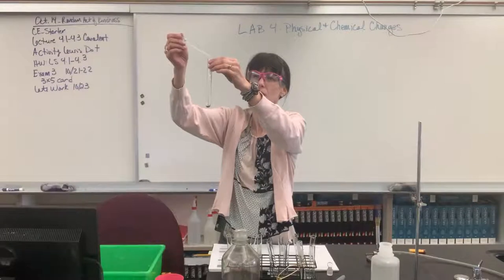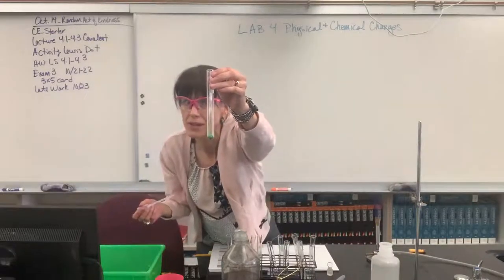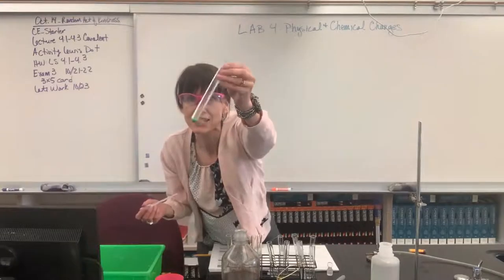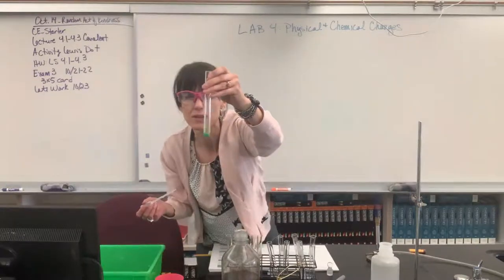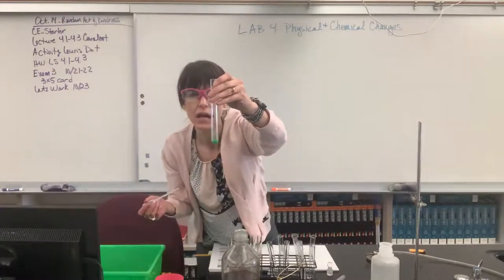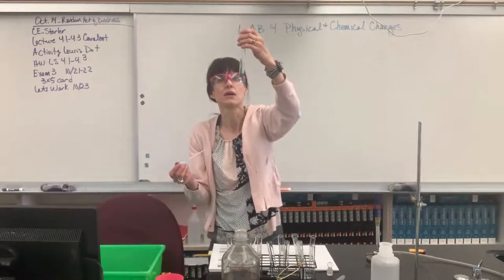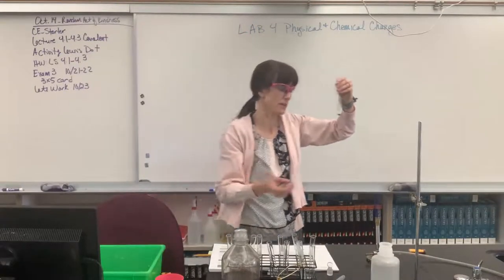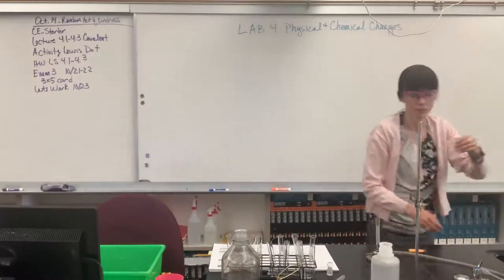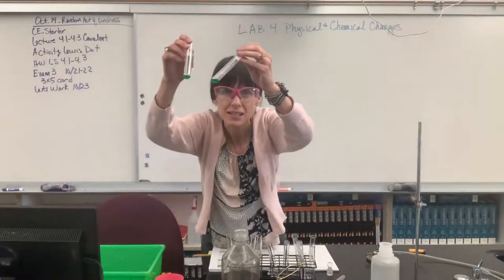Okay, there's 15 drops. I'm hoping you can hear that. It's fizzing and it's green. It's a green color. But we'll let it finish reacting and then we'll compare if it's the same green. How interesting. I wouldn't have guessed that, you guys. How interesting, kind of fun. Let me show you. Guess what? It's identical. It's identical green.